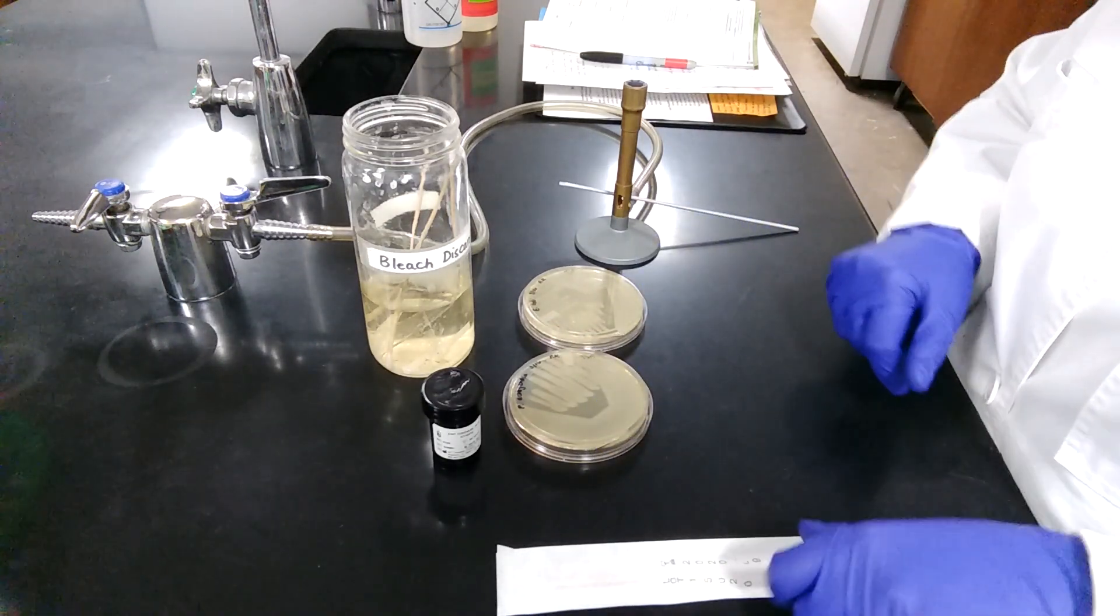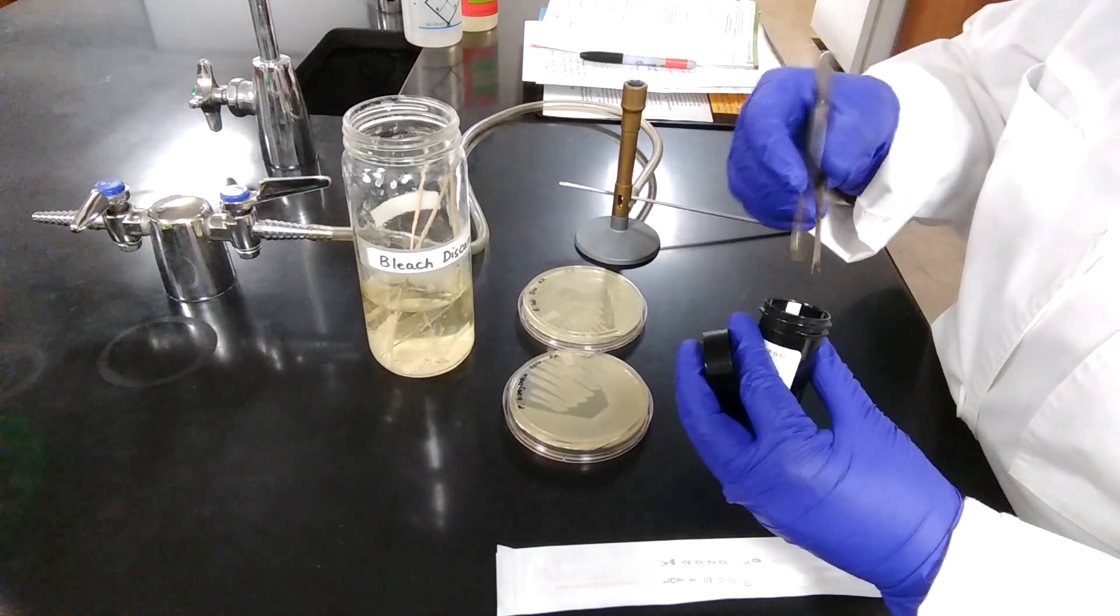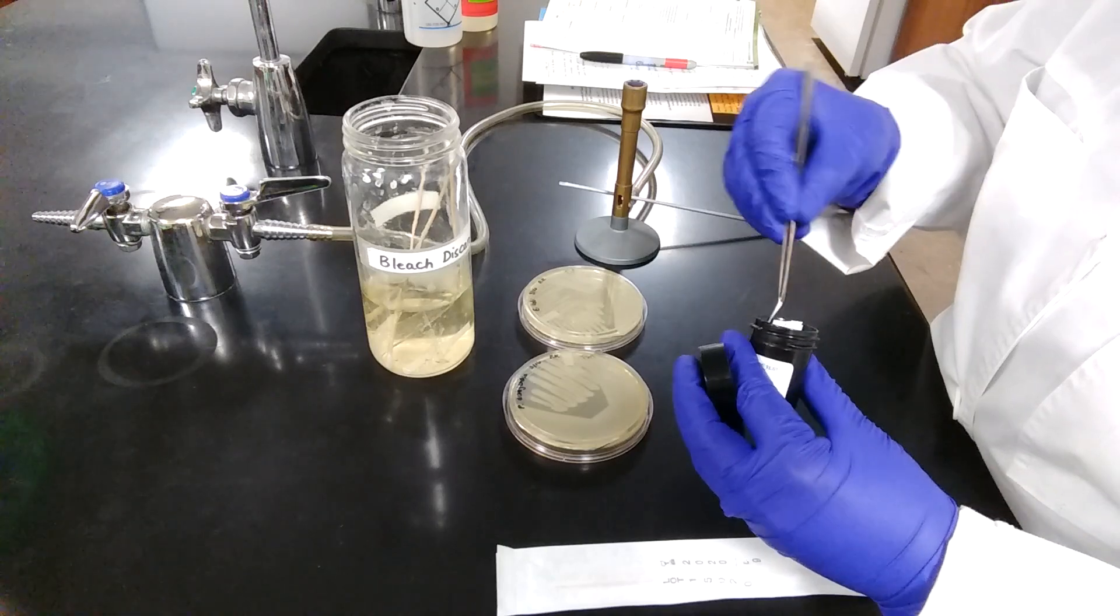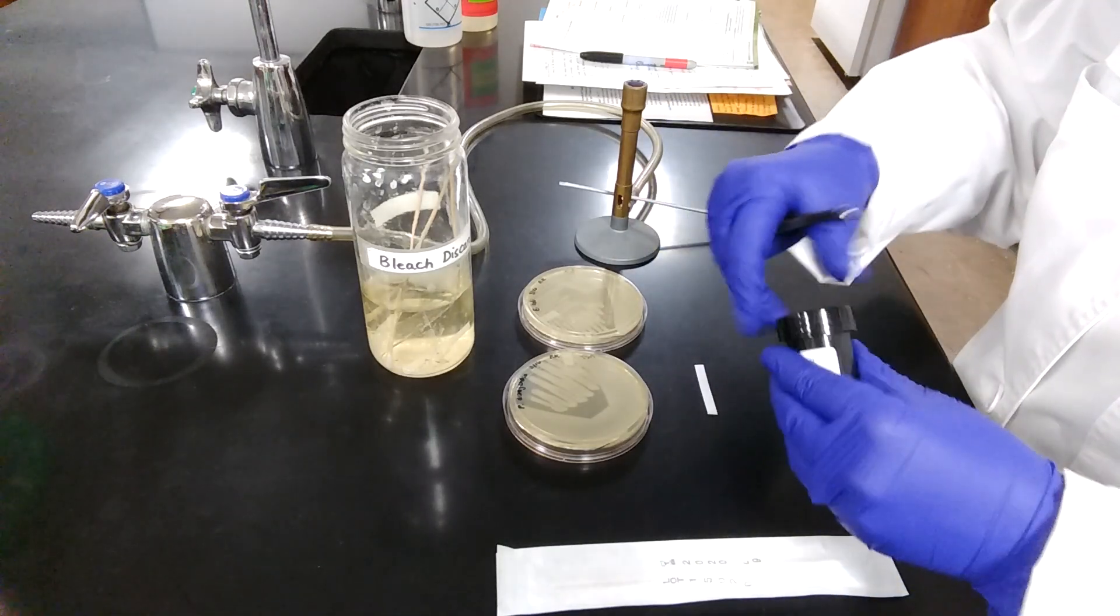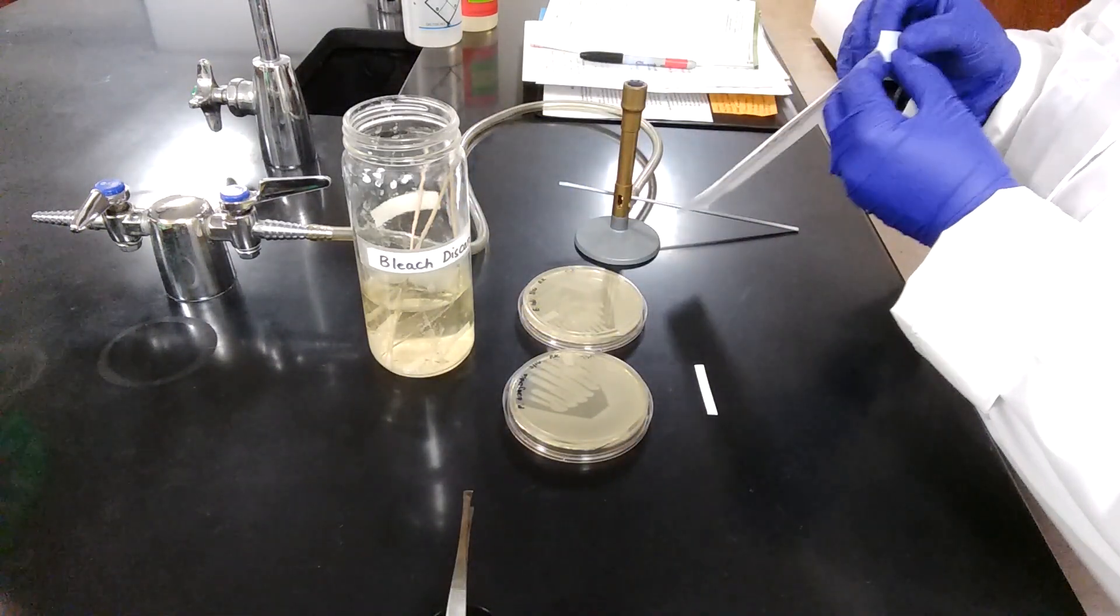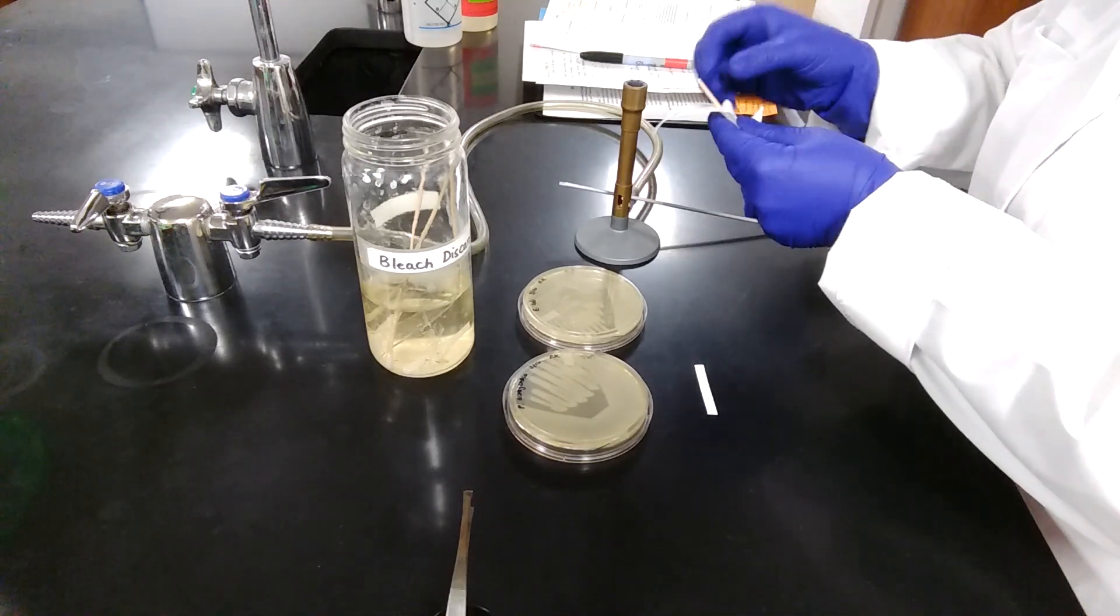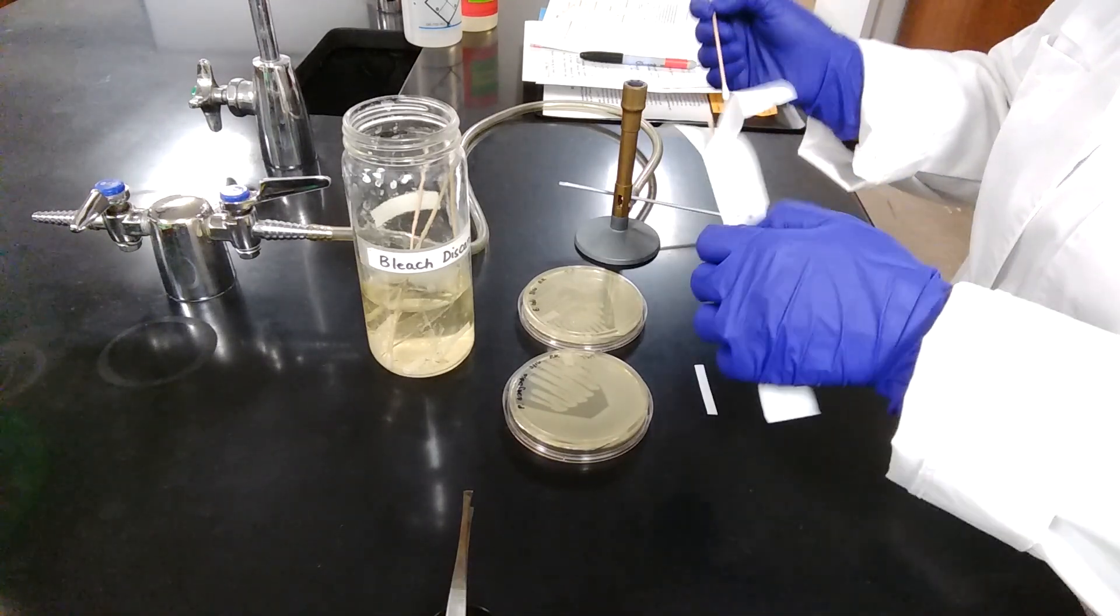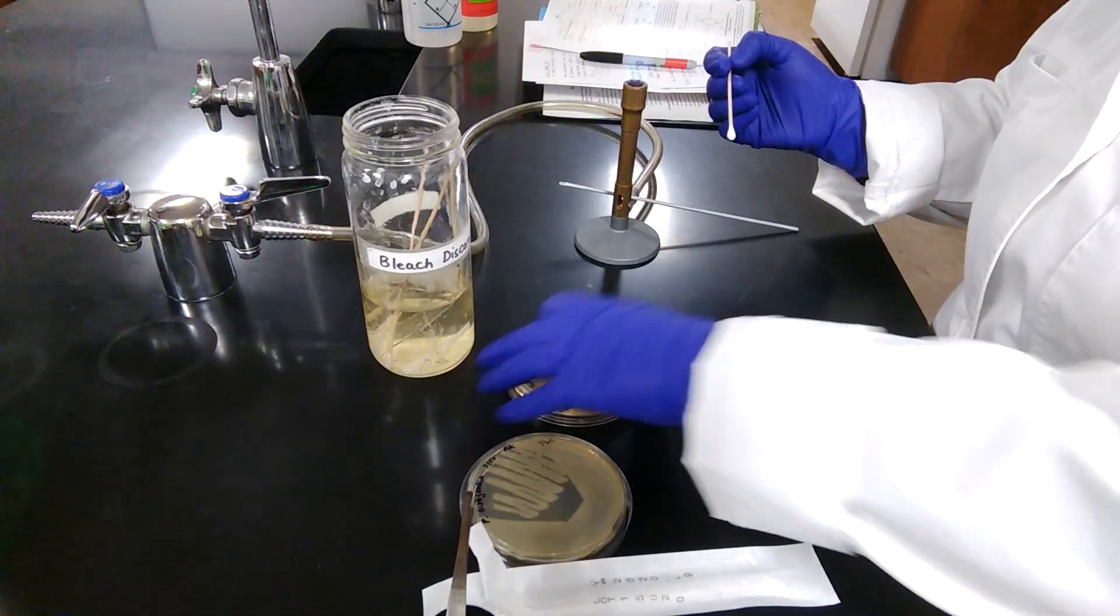For the experiment, first of all, we'll need the paper strip. So I'm taking out a paper strip from this container here. As I told you before, the paper strip contains the oxidase test reagent. Next, we'll transfer the bacterial cultures onto the paper strip using sterile cotton swabs. Aseptically, transfer a good amount of the bacterial culture onto the paper strip.